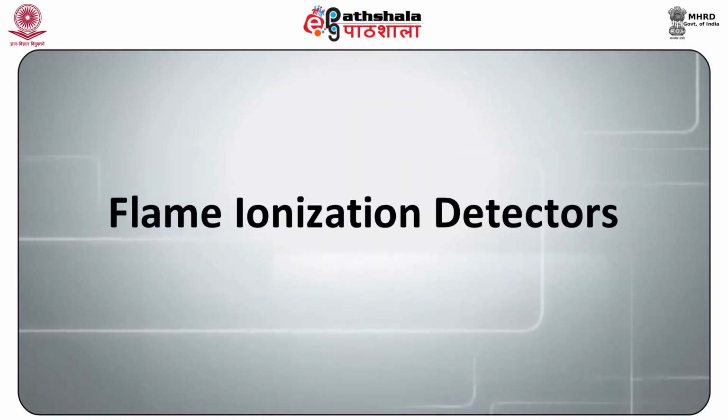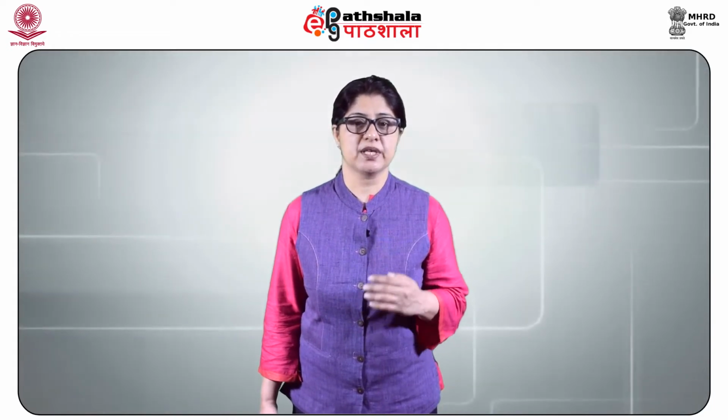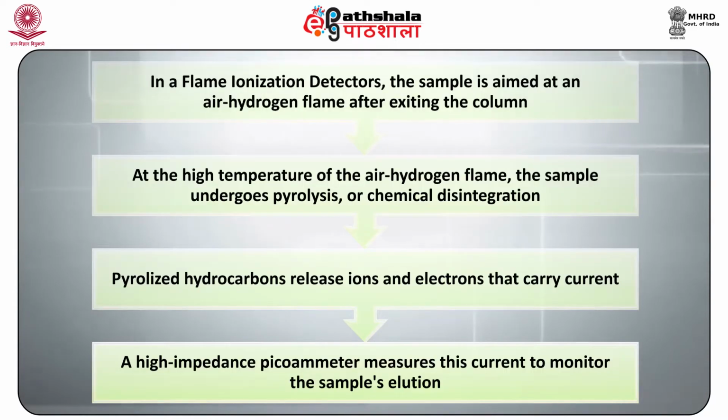Flame ionization detectors. Flame ionization detectors (FID) are most extensively used detectors. In a FID, the sample is aimed at an air hydrogen flame after exiting the column. At such a high temperature of air hydrogen flame, the sample undergoes pyrolysis or chemical disintegration. Pyrolyzed hydrocarbons release ions and electrons that carry current. The high impedance picoammeter measures this current to monitor the sample elution.